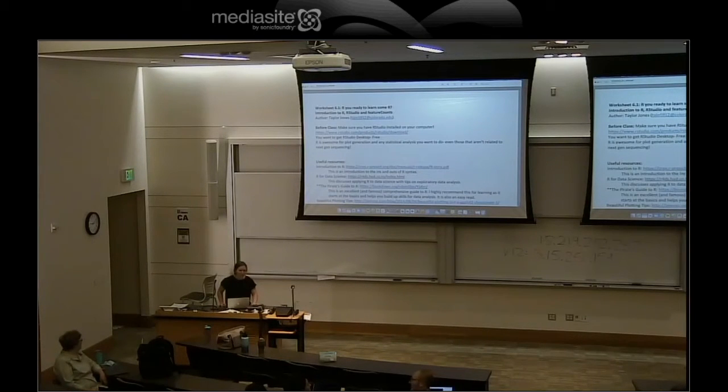So like Mary said, we're going to be working in R today, which probably seems a little scary, but it's not. We're going to start on command line, like Mary said, which you can do if you ever have to do this on a supercomputer, so you can get a little familiar with it. And then we're going to move over to RStudio, which is a much more user-friendly way to actually code in R. We're going to spend about 80% of the time doing that, and then the last 20% we're actually going to count over the BAM files that you guys generated last week.